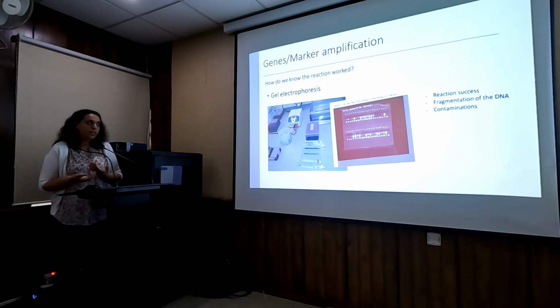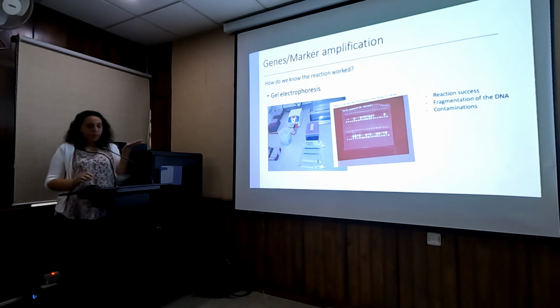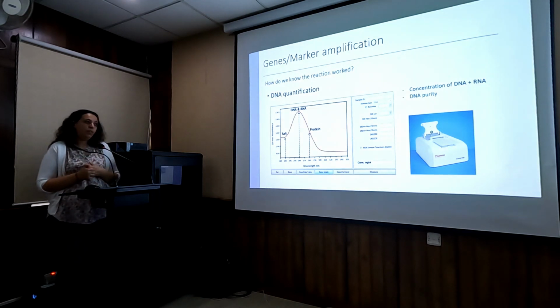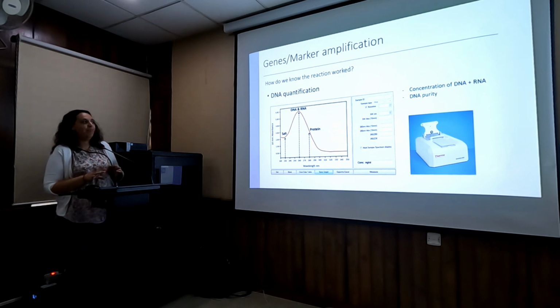And if there's any contamination, you usually get more than one band because it's more than one species. So all of this you can get from your gel. And you can also use something like a NanoDrop, other equipment. So I'm using a brand here. I'm not being paid to say NanoDrop.